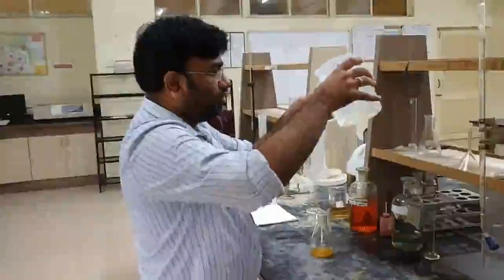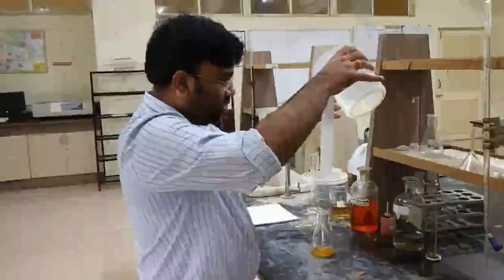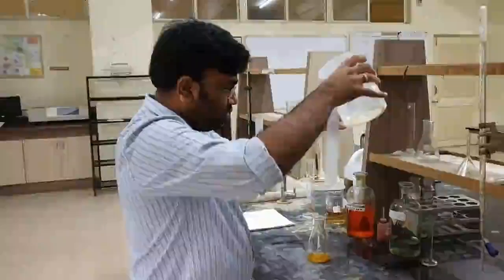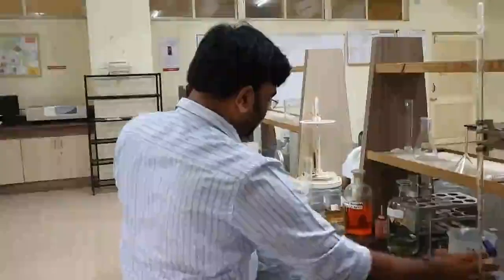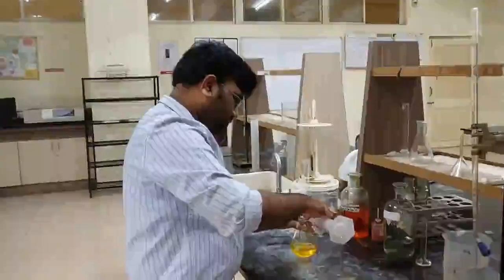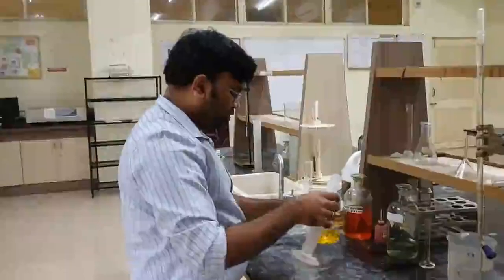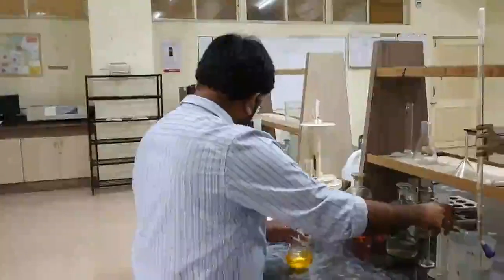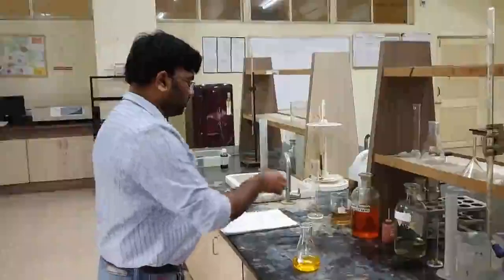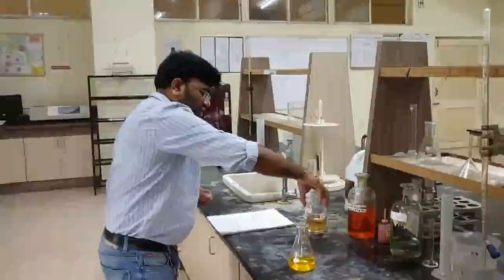It is to be measured via measuring cylinder, and we are going to add 100 ml of distilled water. Right? After that, we are going to add 30 ml of concentrated H2SO4. So now, this is the concentrated H2SO4.